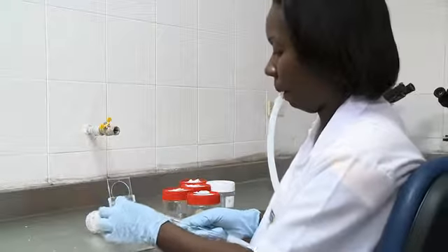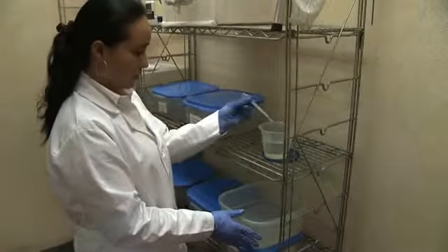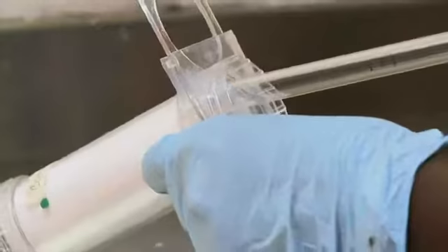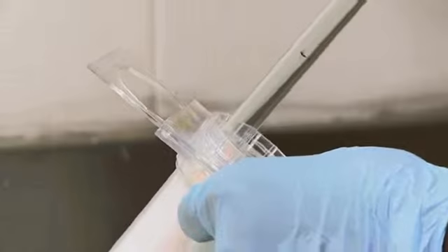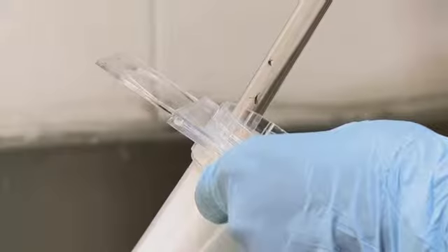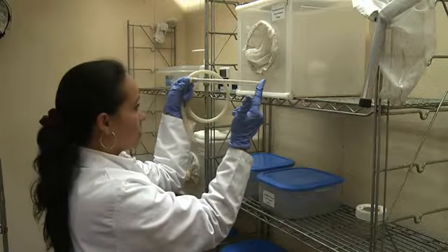To learn more about this, watch the video about susceptibility testing. Where a field-caught mosquito colony is determined to be fully susceptible, then members of the same sample colony raised in the insectary may be used. Where test numbers are not enough, the insectary colony could be raised through the next generation to increase the number of mosquitoes available for the test.